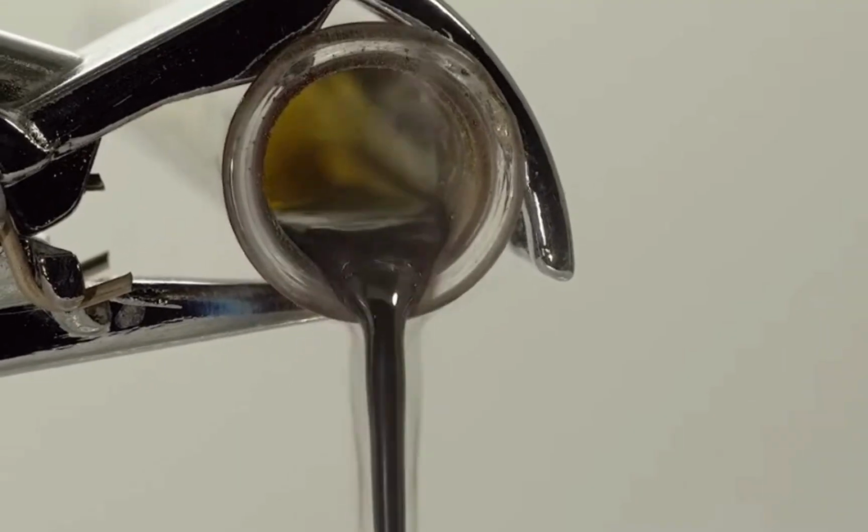When molten selenium is poured into water, you get these black biconcave discs.